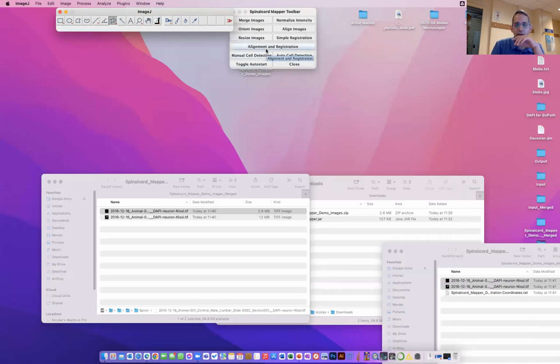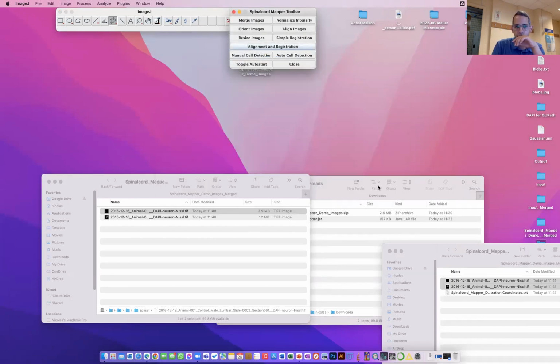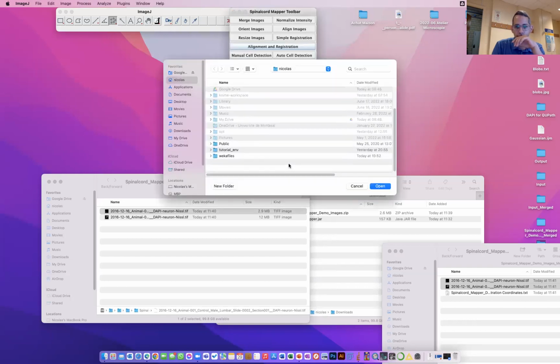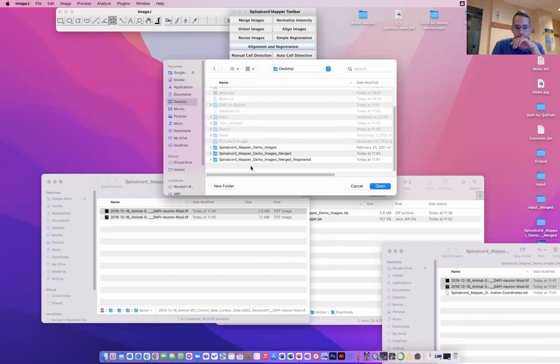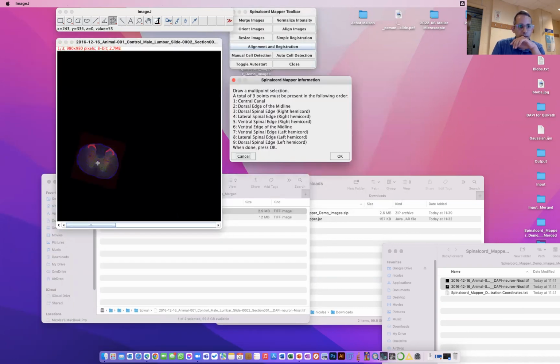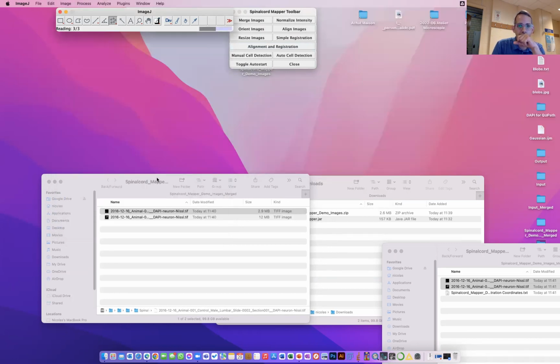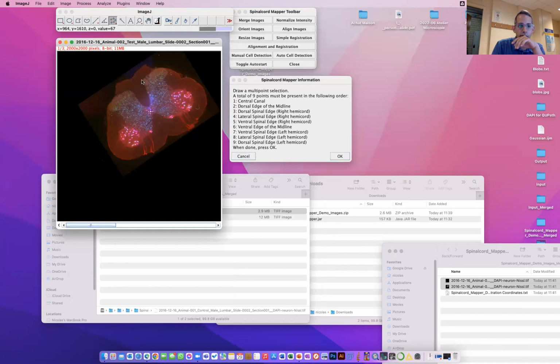You can actually align them also. Same thing, but this time it will align them one to the other. This is useful when you have several images and you want them to look all the same at the end. Damn it, I forgot always the same one.